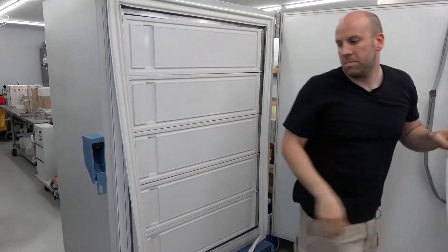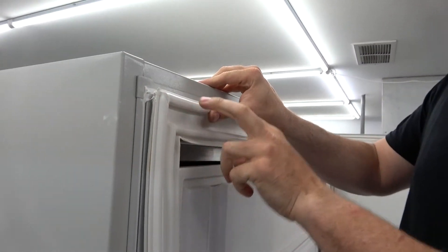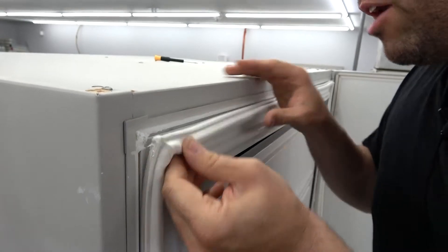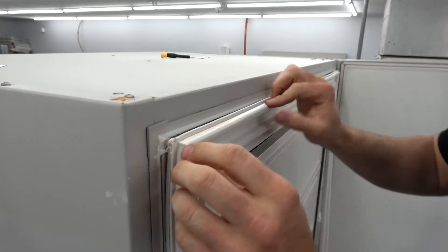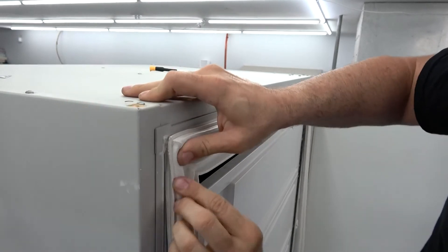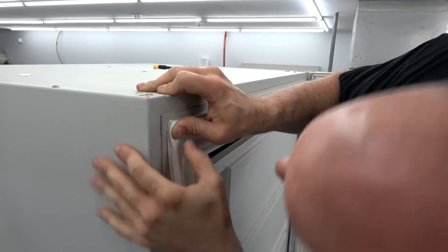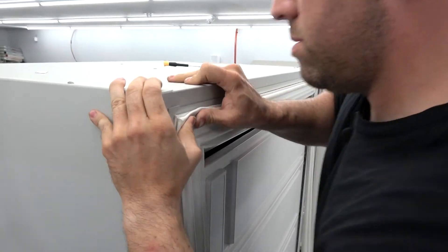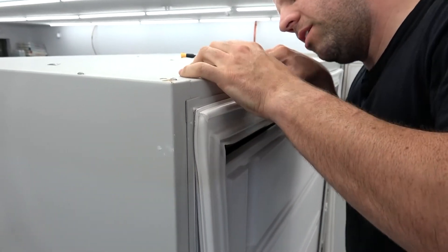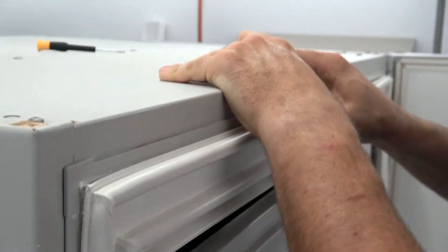I already have the top part of the seal in — remember, this is a double seal, so there are two tracks that both have to be in. I already have the whole top in and I'm going to start putting this one in now. The corners are kind of the hardest part to get in there because they're really beefy, but the rest of it is pretty simple — just a matter of pushing it in. The corners can be a bear sometimes. You just start at one end and keep feeding it into the little channel. Once you get going, it's so easy.